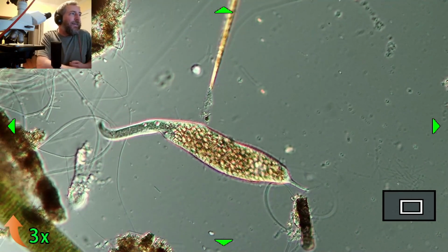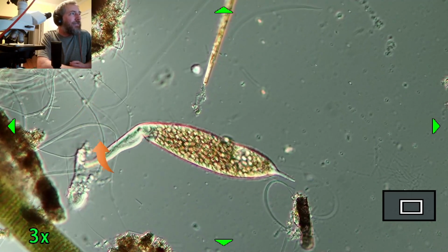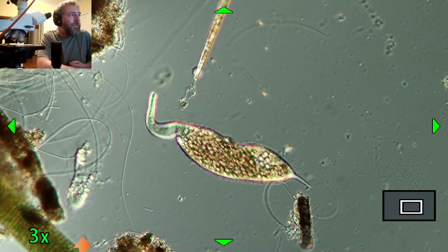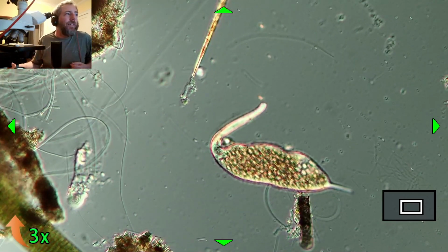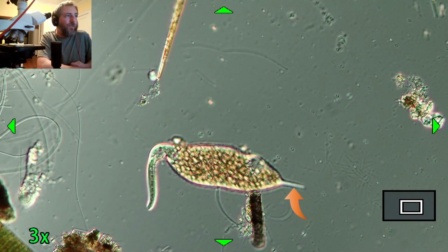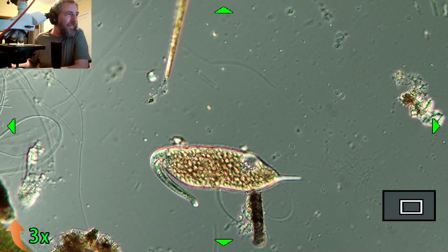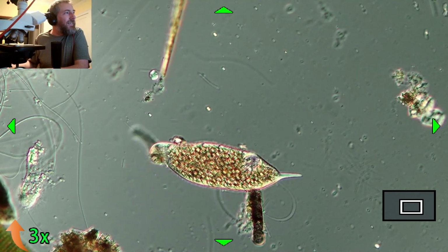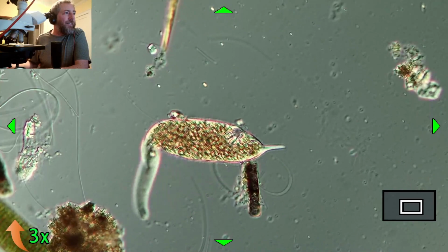There, it looks like it has two little eyes, but that's not what those are. Those are vacuoles that it has all along the length of the trunk. They actually go all the way down the body, but I think this one's all full of food. There you can see it's like a ribbon, and its tail is actually this end, right here. That's the tail, this little tiny bit. Got a cute little tiny tail. That's the tail end. I think it's really gorgeous, especially here in the DIC light.